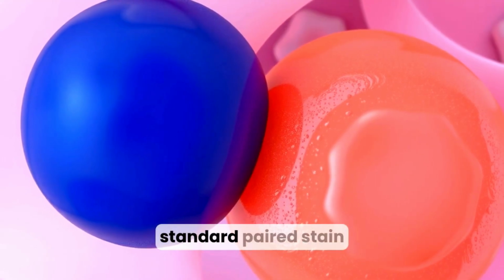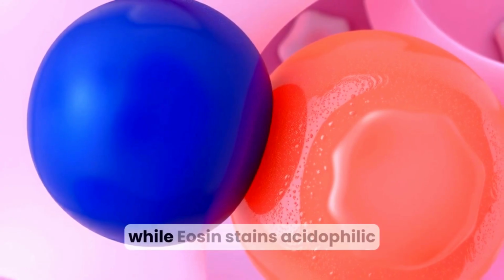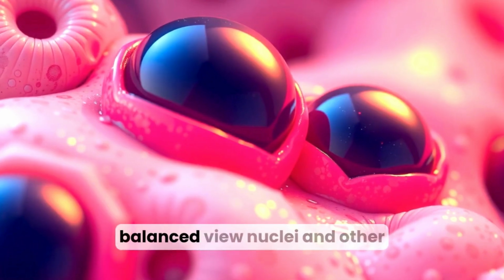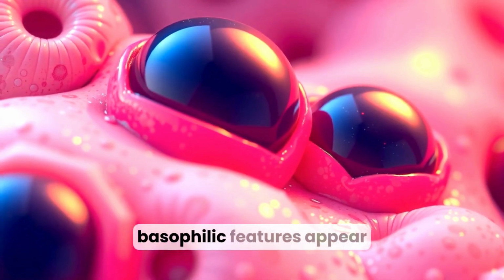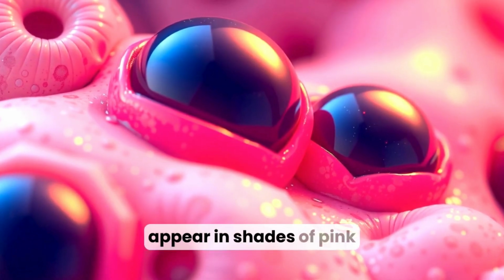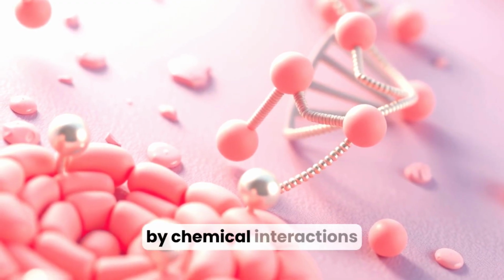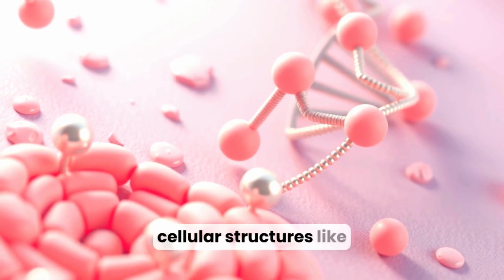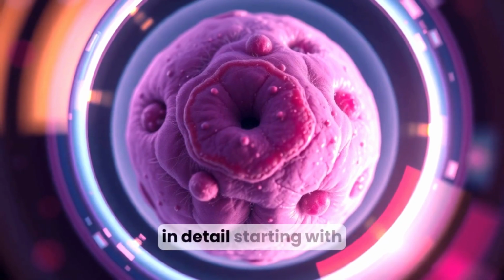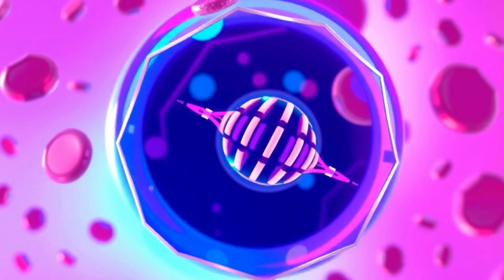Hematoxylin and eosin is the standard paired stain. Hematoxylin stains basophilic structures blue to purple while eosin stains acidophilic structures pink to red. Together they provide a balanced view. Nuclei and other basophilic features appear blue-purple, while cytoplasm and extracellular proteins appear in shades of pink. Understanding dye affinity is the key. Affinity is determined by chemical interactions between dye molecules and cellular structures, like nucleic acids and proteins. Next, we will examine each dye in detail, starting with hematoxylin and why it highlights nuclei so effectively.